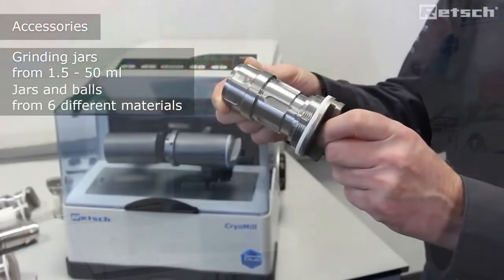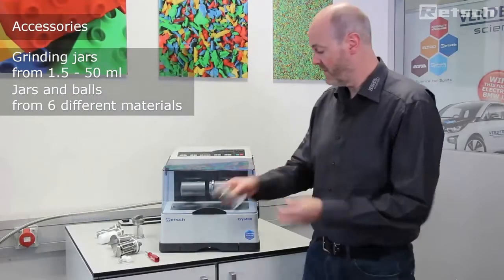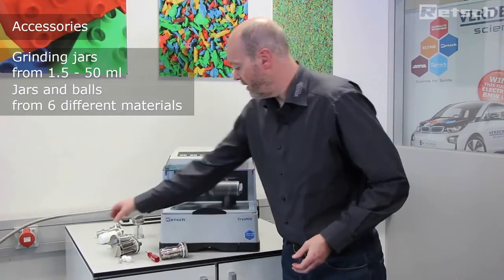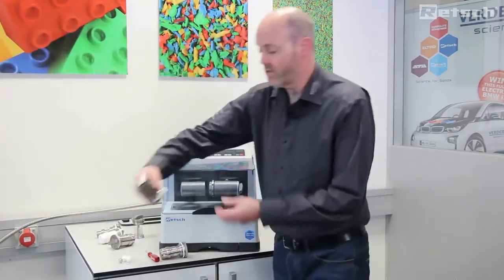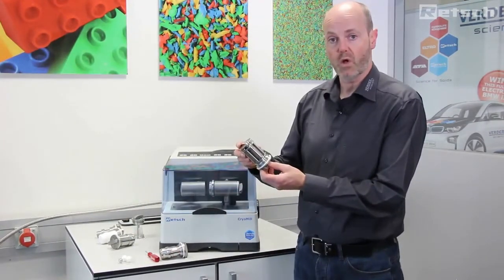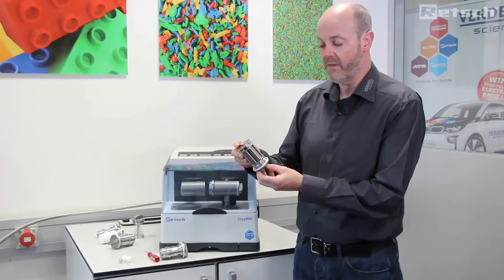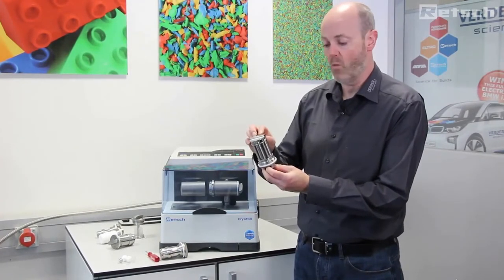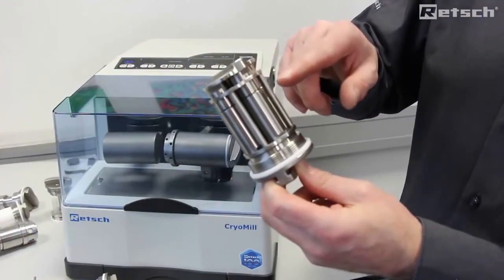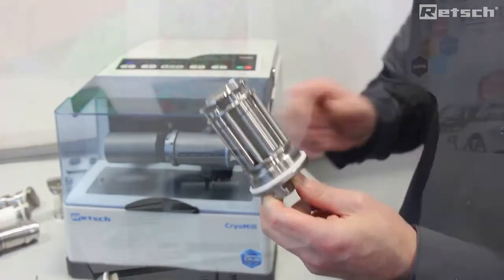The largest size, as we show here, is the 50 milliliter, and we go down to grinding jars as small as 5 milliliters. And in this instance we have an adapter whereby we can run either two or four samples of this size simultaneously to facilitate a much larger throughput rate.